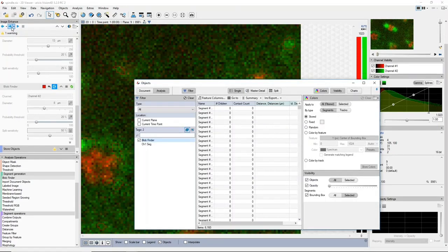But the other thing you may remember is that the distance operation works based on the distance between either the edge of the object, so the surface of the geometry of the object, or the edge of the bounding box, or the center of the geometry, the single center point of the geometry or of the bounding box. And depending on which one you use, you obviously get different degrees of accuracy and different degrees of speed.